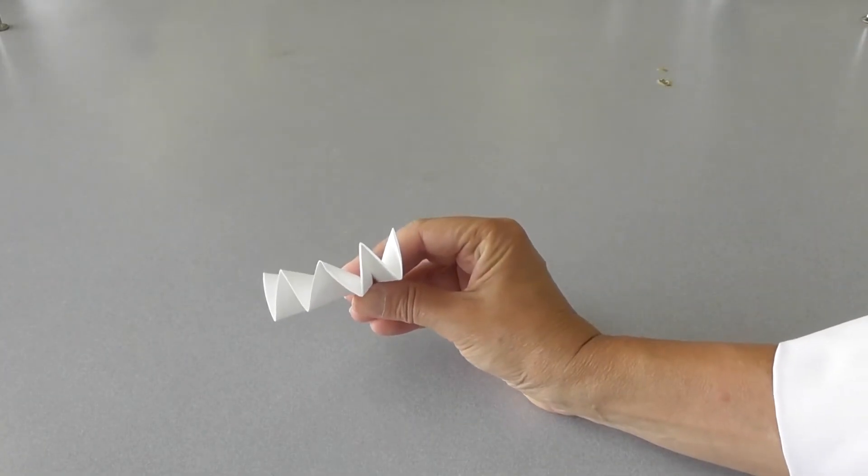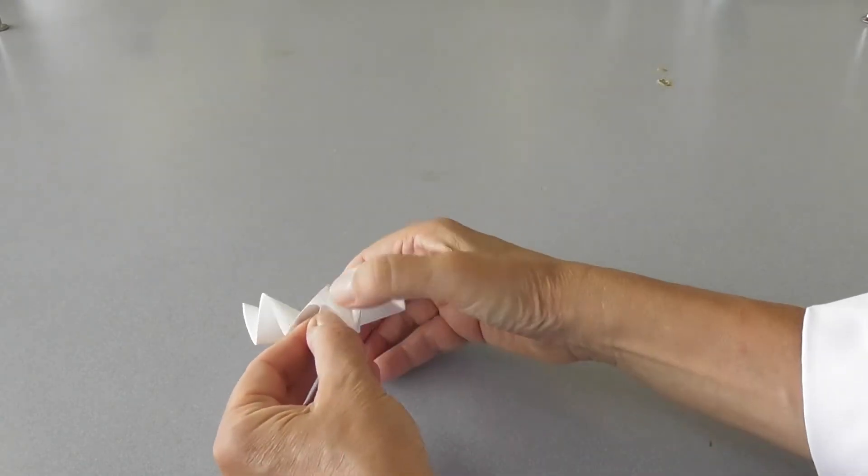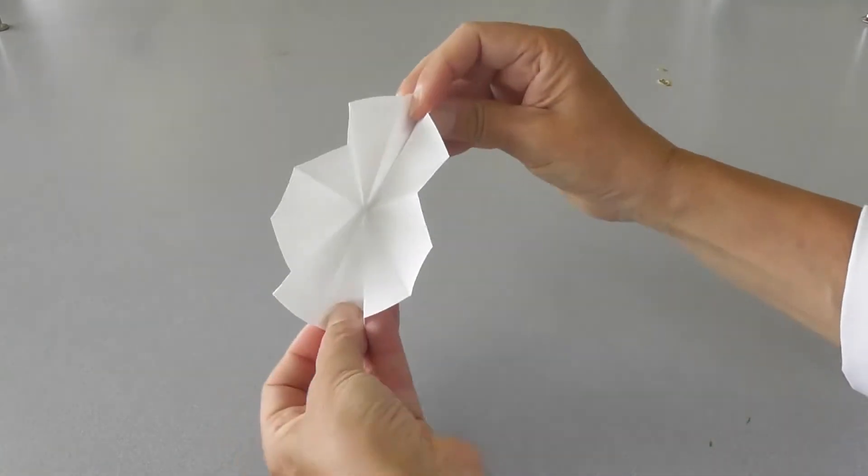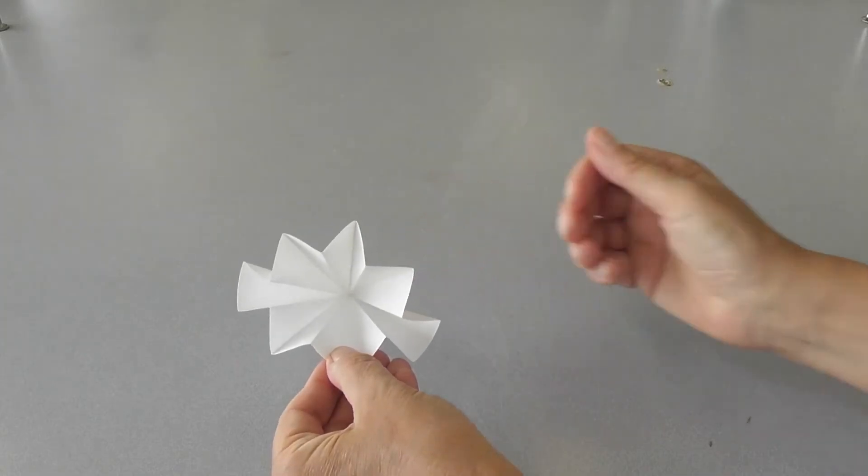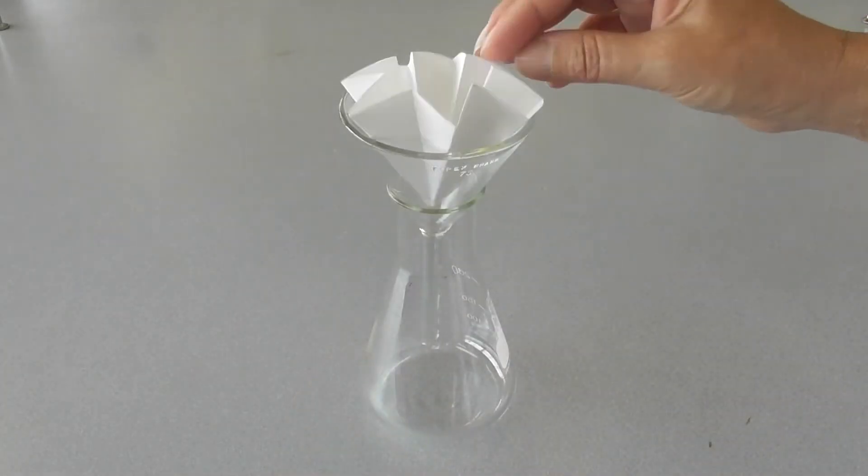If using fluted filter paper, open the filter paper and place it into the funnel. The fit into the funnel does not have to be tight. Once liquid has been poured in, the filter paper will be held in place.